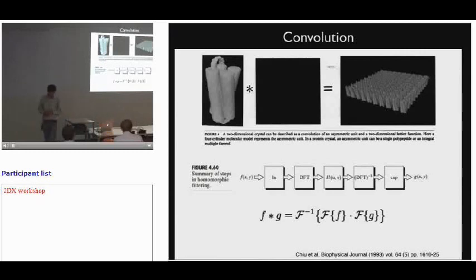So now the next topic, which is related to this kind of filter operation, is the basic idea of convolution. A convolution you can think of in two ways, basically. One of them is the real space way, and this is pretty intuitive. So this is pretty much a 2D crystal situation. You basically have a molecule of interest, and then you have a real space grid. You want to place that molecule on a very regular binary grid, and then you can go ahead, of course, and apply the translation, and then you end up with a crystal. And this is what you would pretty much do with a convolution.